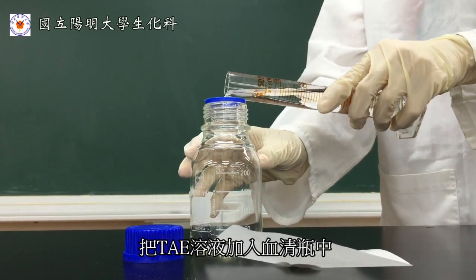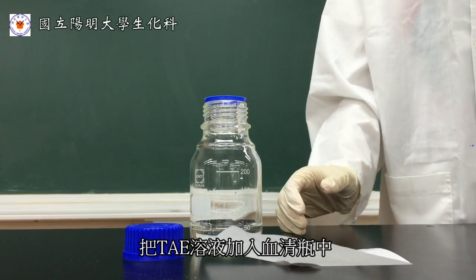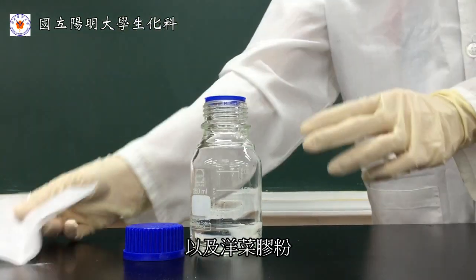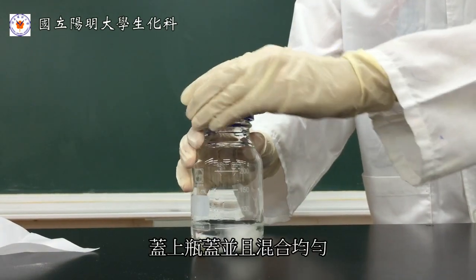Add TAE buffer into the serum bottle, as well as agarose powder. We then close the lid and mix thoroughly.